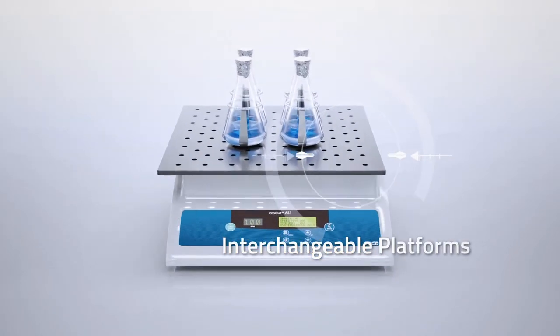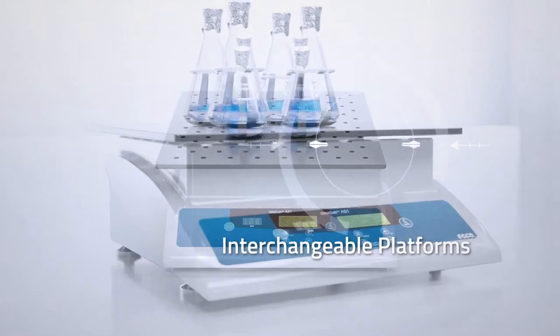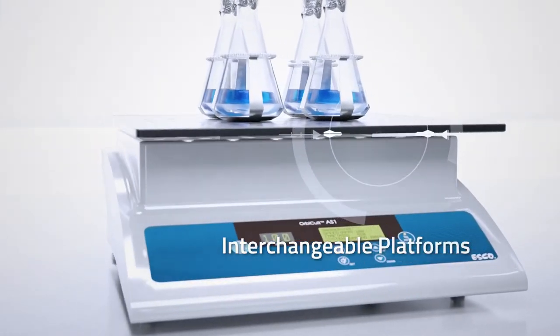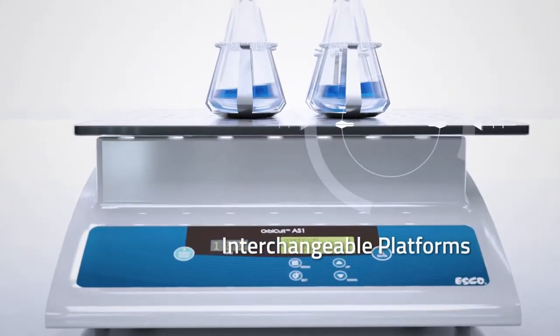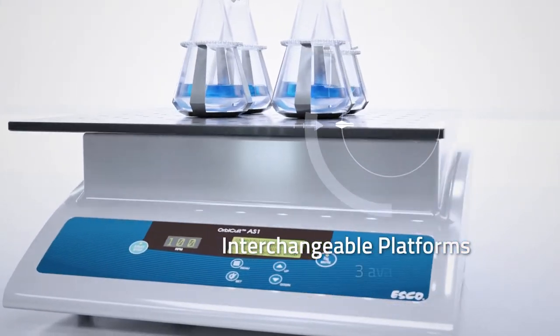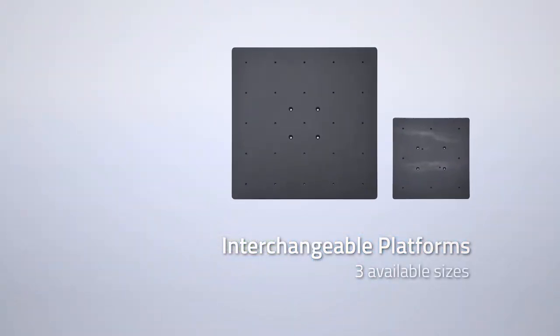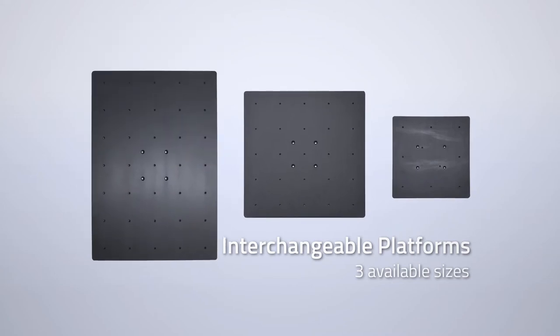Interchangeable platforms customizable to accommodate different applications. Three interchangeable platform sizes are available to minimize the footprint.